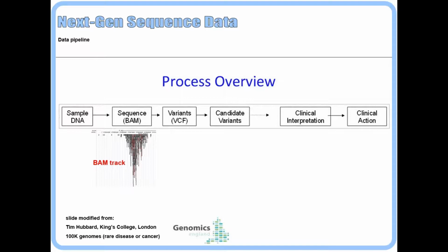At that point, Genome Browser can be useful to you for interpreting the results. And you can see here, this particular BAM track that I'm showing you is a cartoon of the kind of signal you would get from an antibody experiment where you pull down a piece of DNA, and the center of this peak represents the place where the target of that antibody was bound to the original DNA. And then you have a bunch of overlapping reads that spill out on either side.